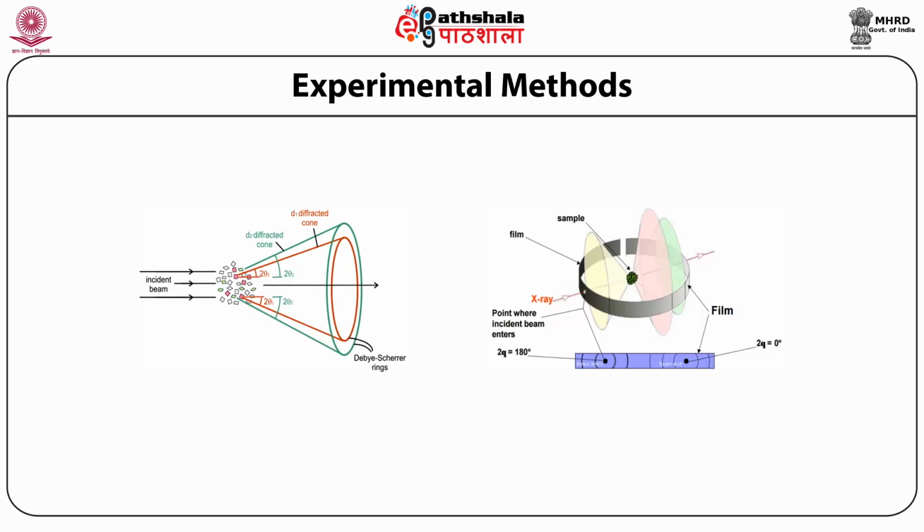So in single crystal X-ray diffraction, we have to rotate the crystal with respect to the incident beam so that a particular set of HKL planes make the correct angle with the incident beam so as to satisfy Bragg's law. Whereas a crystalline powder contains a large number of small crystallites, each of which is randomly oriented. At any one time, all the allowed HKL planes will be correctly oriented in the X-ray beam and satisfy Bragg's law of diffraction. For every possible HKL, some crystals will make the correct theta for diffraction to occur.